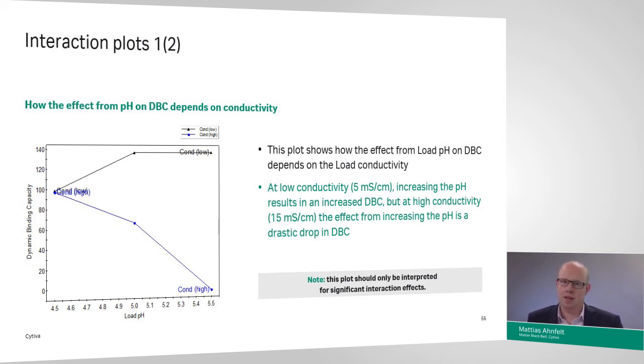And with those kinds of ion exchangers, and that's true both for GE and other resins, we observe a non-typical dynamic binding capacity behavior. So classically, for a non-grafted, non-surface extended ion exchanger, we would expect the lowest pH and the lowest conductivity to give us the highest binding capacity. But as you can see already on this graph here, that's not what we get.